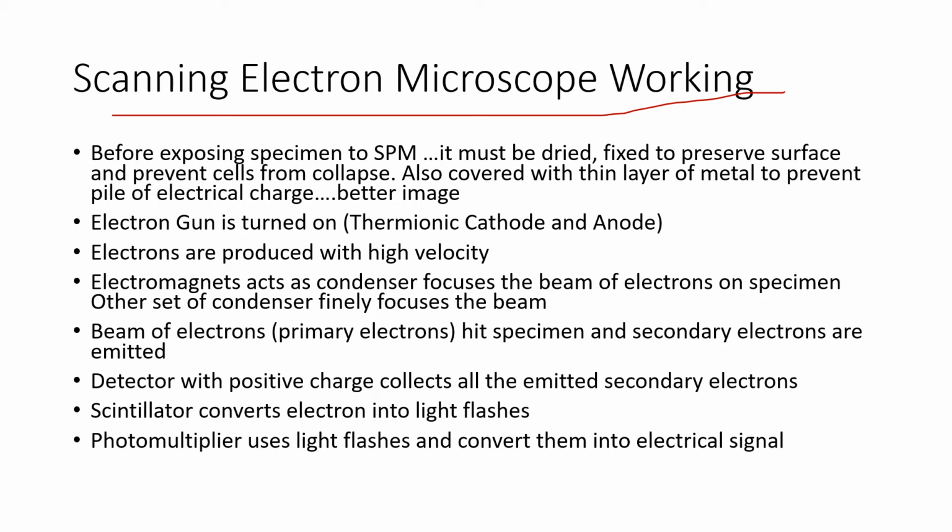we make sure that these specimens are dried, dehydrated, and also covered with a thin layer of metal so that no collection of electric charge takes place. How we stain our specimen for scanning electron microscopy and transmission electron microscopy will of course be covered in the series, but this point you should remember because this is special. Now finally, let's get into the working.